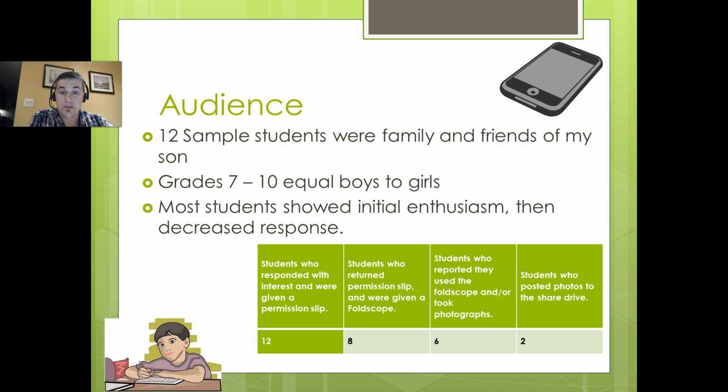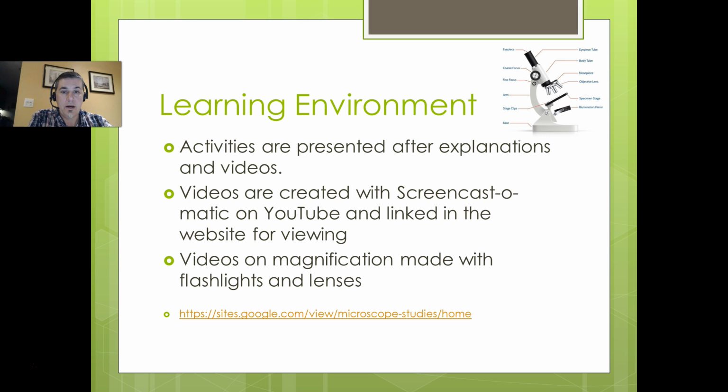But they're so inexpensive, it's easy to be able to just hand out 20 or 30 microscopes to students at $1 or $2 each and say, go out, find some images, post them to the Google site, and let's see what everybody comes back with.